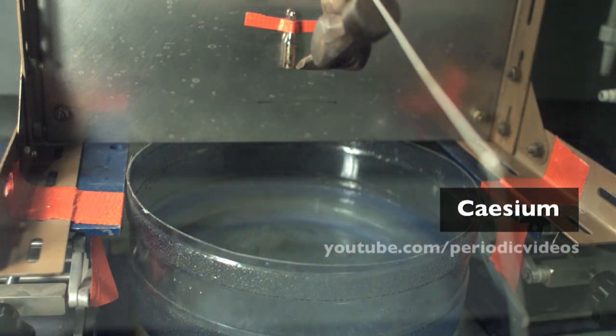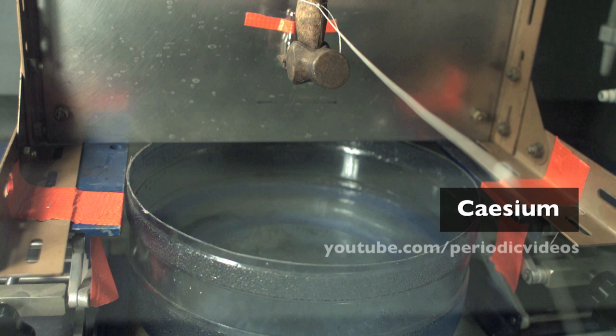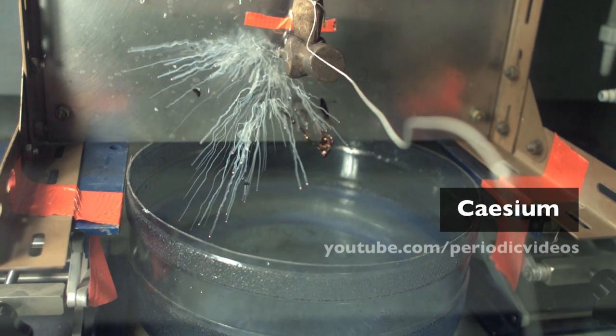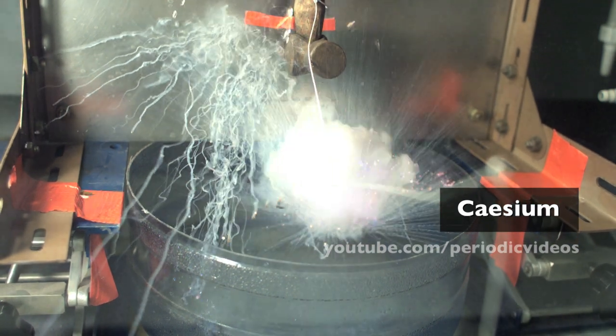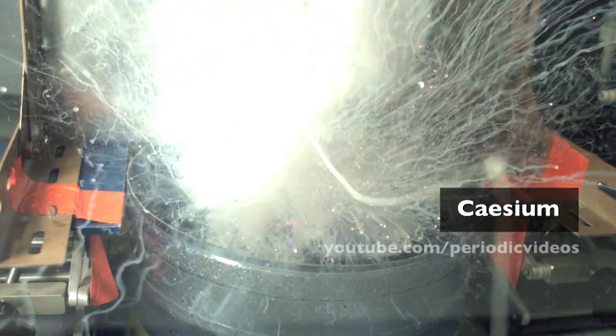In our last high-speed video, you saw caesium, and it was really good the way it reacted quite violently. But then we thought we should have put an indicator in the water to see what happened — did it go alkalised, as one might expect, and how fast does the indicator change?